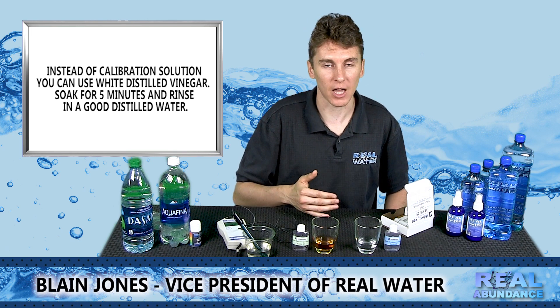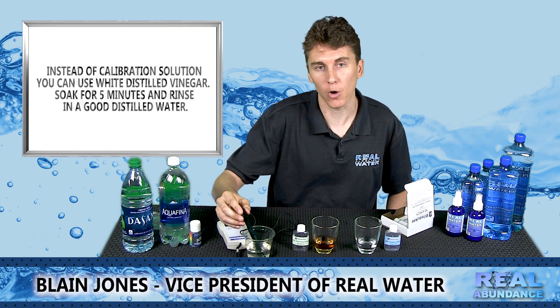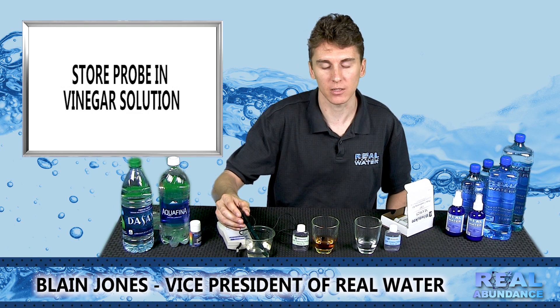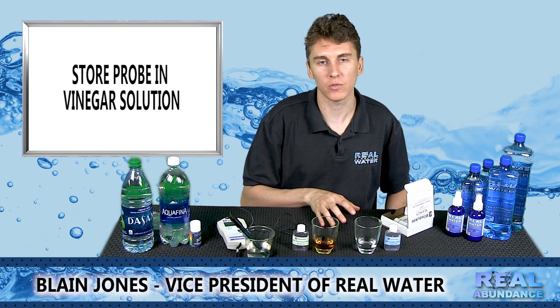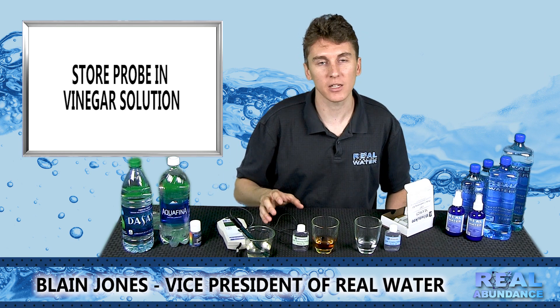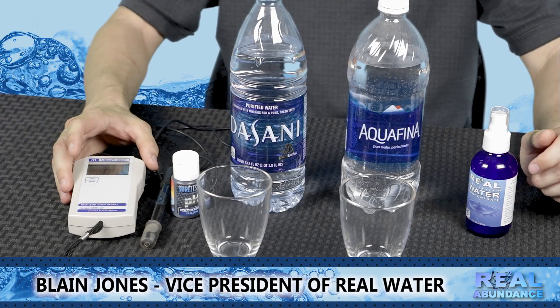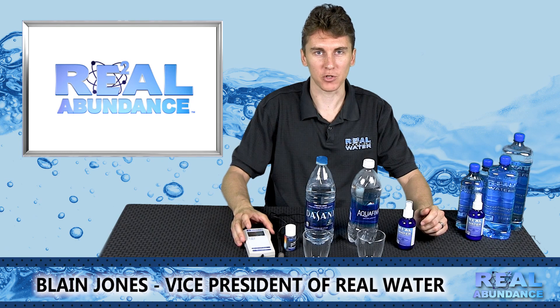You can even do it up to six times depending on the age and condition of the probe and how out of calibration it is. But once you do this a number of times, your ORP Meter and probe should read negative readings accurately and consistently. So now that you have your ORP Meter calibrated, you are ready to do a product demonstration.